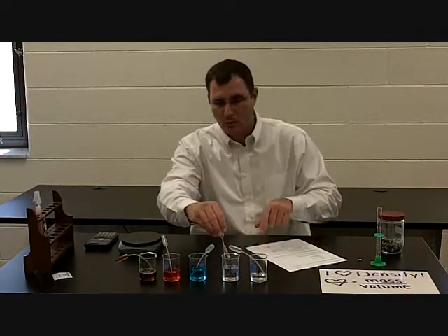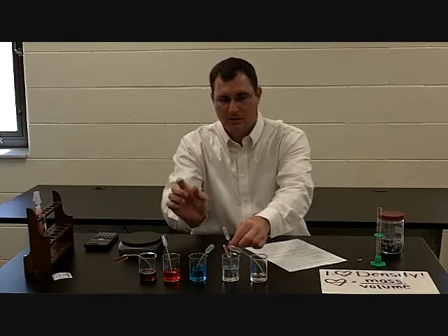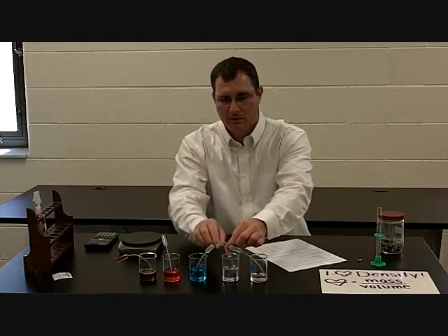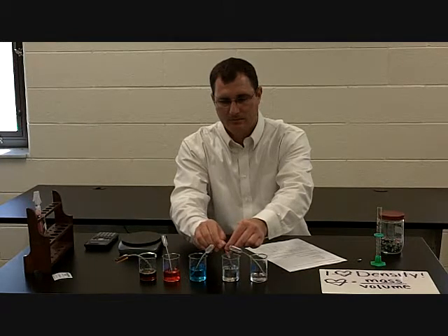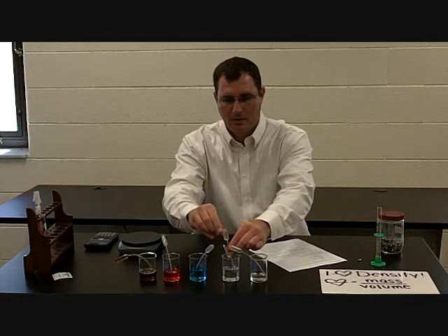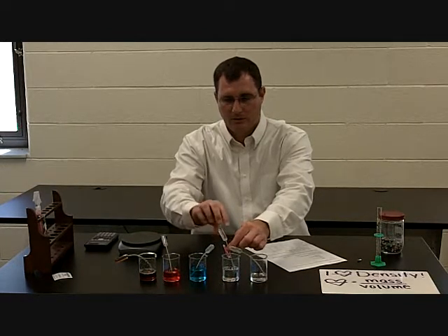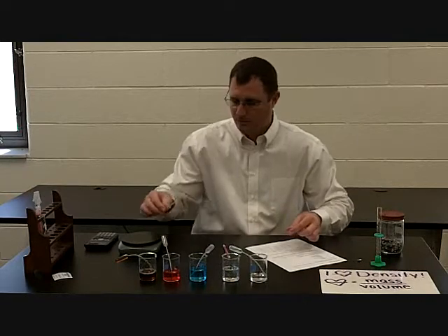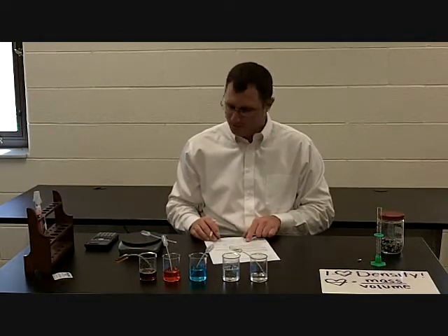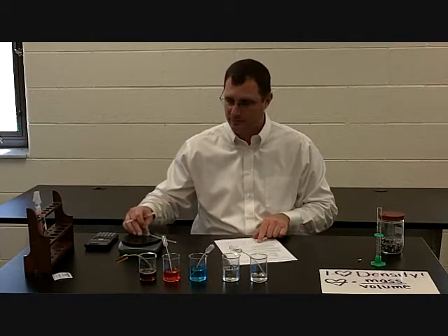Now I'm going to do the mineral oil next. I get one squeeze and I get most of it full. Get the air out and let it pull it up. Once it's totally full, I'm going to weigh that, and my mineral oil weighs 4.9 grams.